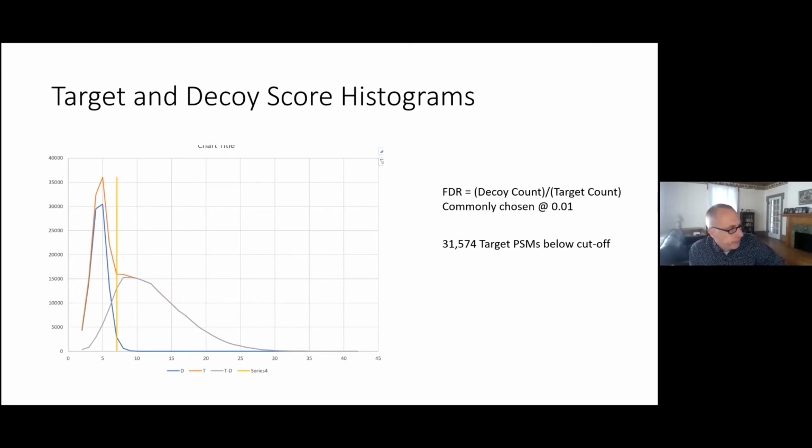Yeah. I do just want to make a clarifying statement. We do use PSMs for protein inference. The PSMs are our input for the protein inference algorithm, but they are quickly collapsed to a sequence basis. But we do take the 1% PSMs as our input for protein inference, not 1% peptides. Oh, okay, thanks, Rachel.